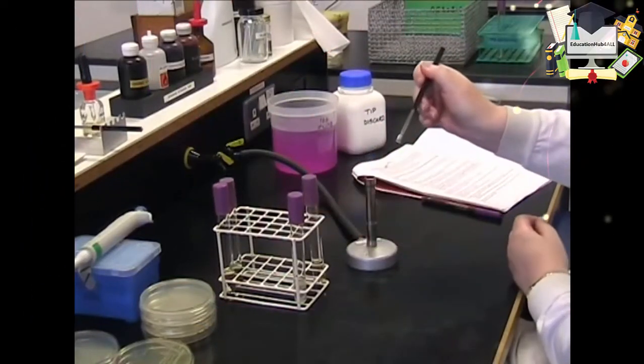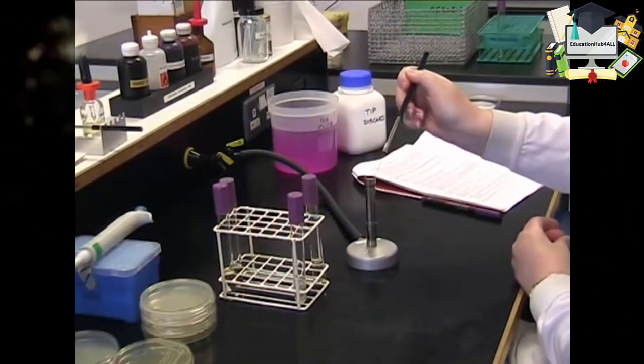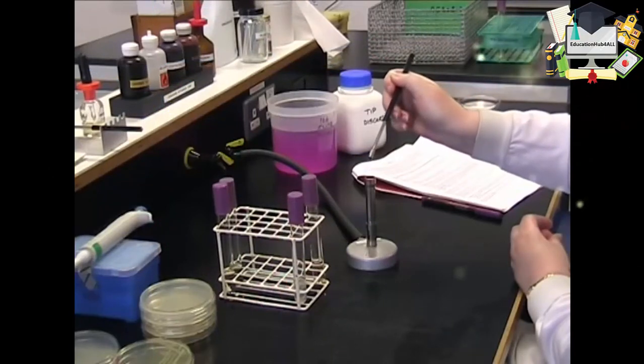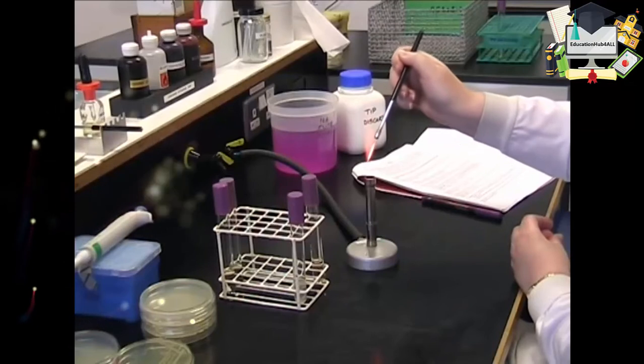We've now got a loop full of liquid in our loop, which we need to make sure we sterilise without causing any splutter. So we're going to draw this very slowly up through the flame and make sure we don't spit and splutter across the bench.